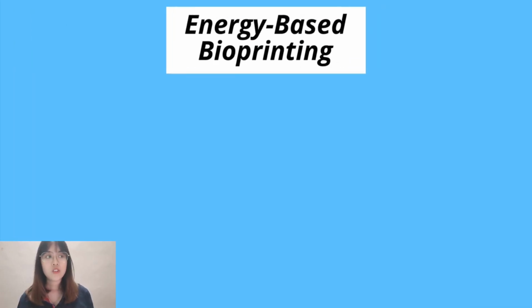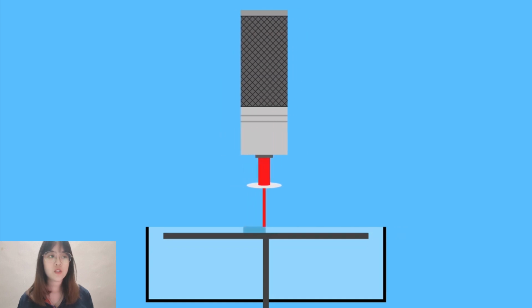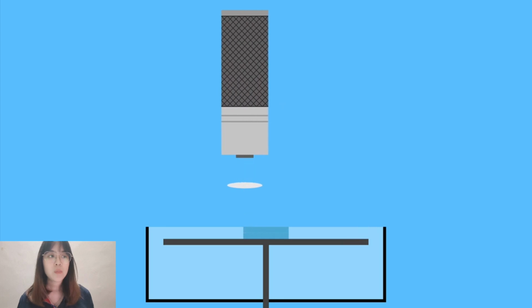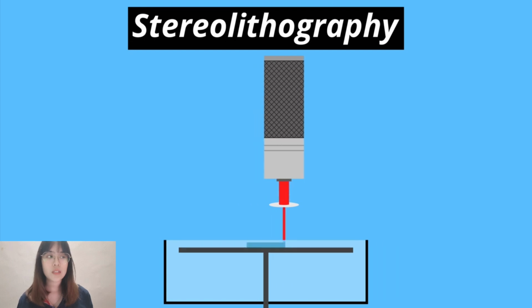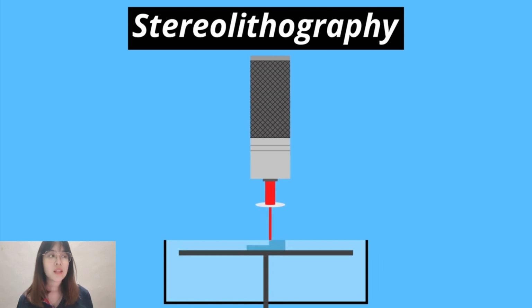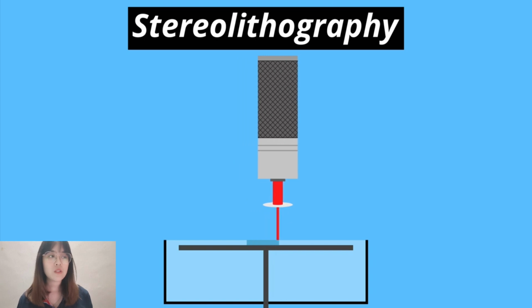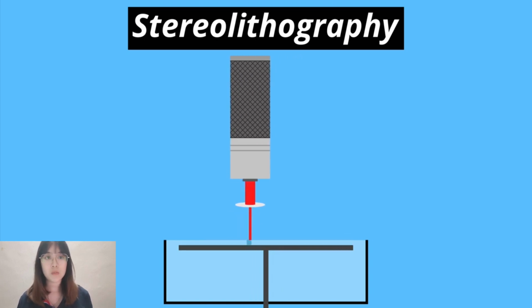Finally, in energy-based bioprinting, a focused energy source, often a laser, is used to selectively solidify or stabilize the bioink. Perhaps the most notable method of energy-based bioprinting is stereolithography, in which a laser is employed to selectively harden a small amount of bioink, which contains a light-sensitive hydrogel. This substance lies on a platform that is then moved away from the laser by a small amount.